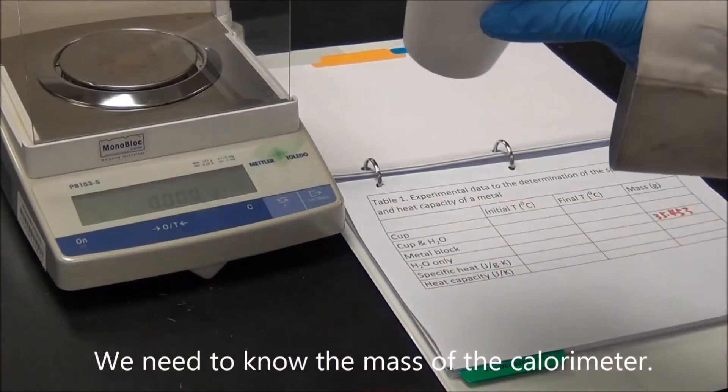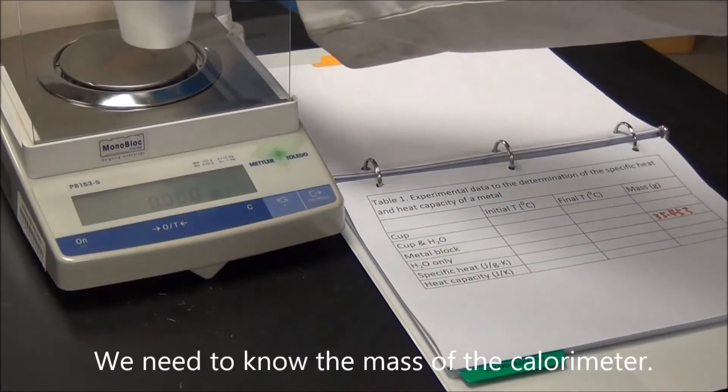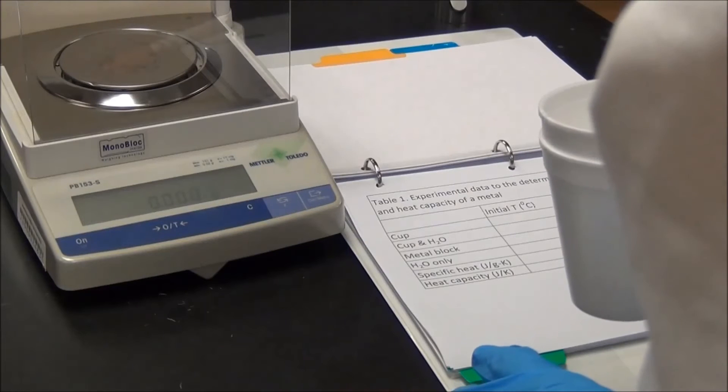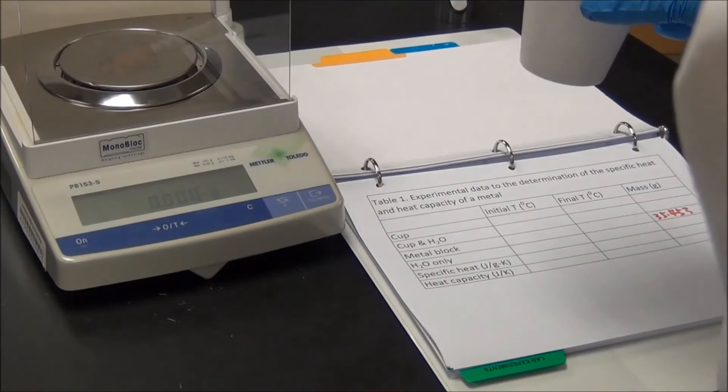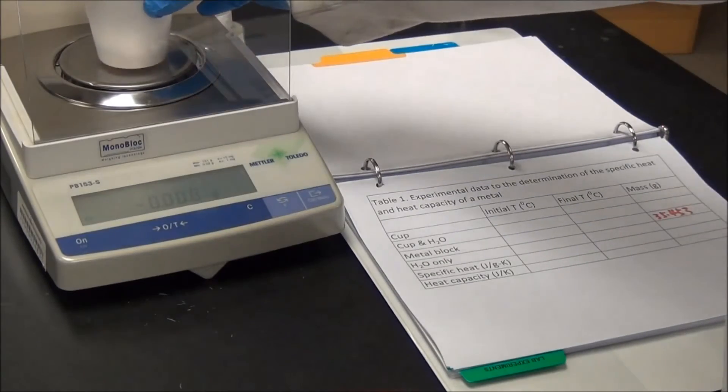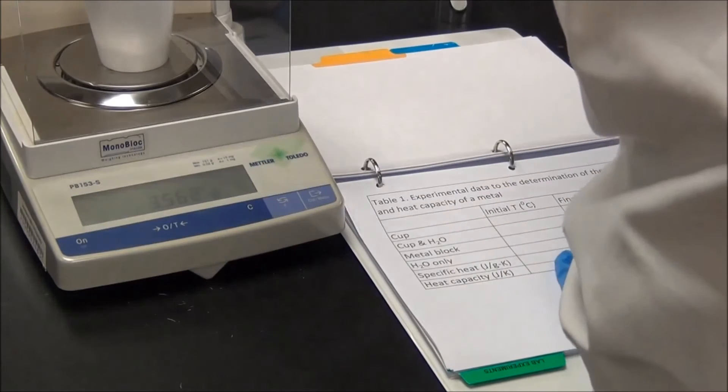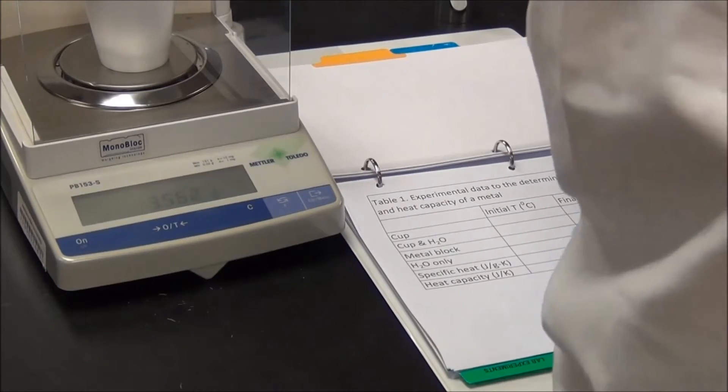For this mini lab, we also need to measure the mass of the calorimeter. Let's make sure the reading is zero before we place the cup on top of the balance. And then the mass of the cup is 3.562 grams.